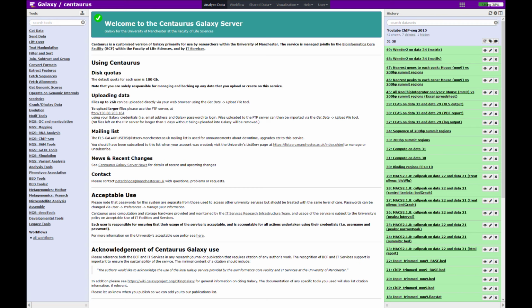Before we start rearranging file formats, it is useful to filter binding regions and consider those that we believe to be good or real binding regions. This is primarily determined by the Q value, however, there is usually a subset of regions with high Q values but low fold enrichment, which I tend to think of as less than 5. It's kind of arbitrary, but has worked well for me in the past. If you were to look at these regions on a genome browser, you would see a huge enrichment of ChIP fragments, but also a large genomic background.